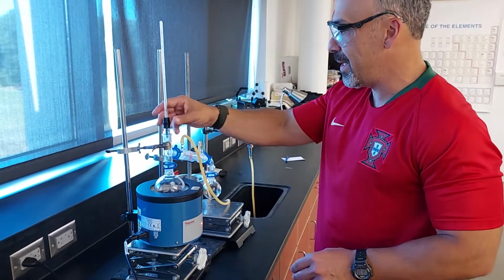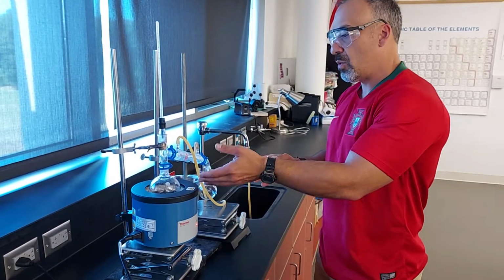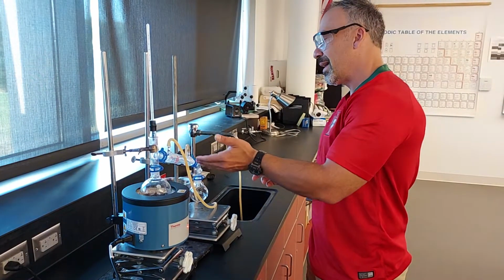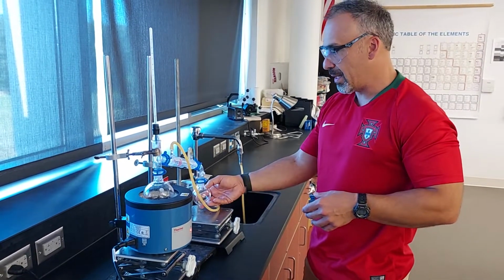And so the idea is we heat it up. This is a condenser. It's going to change into steam, or rather into a gas. It's going to come through this condenser. The condenser is going to change it back into a liquid, and we're going to collect it in this receiving flask.